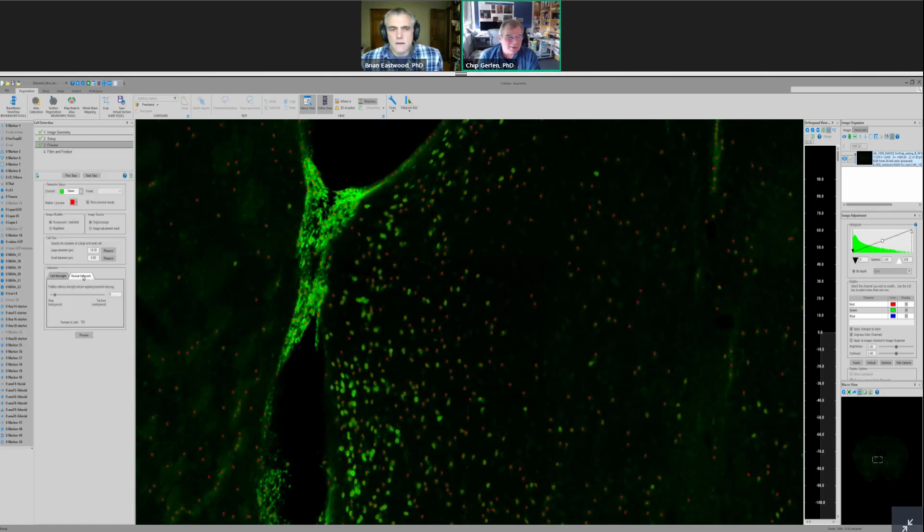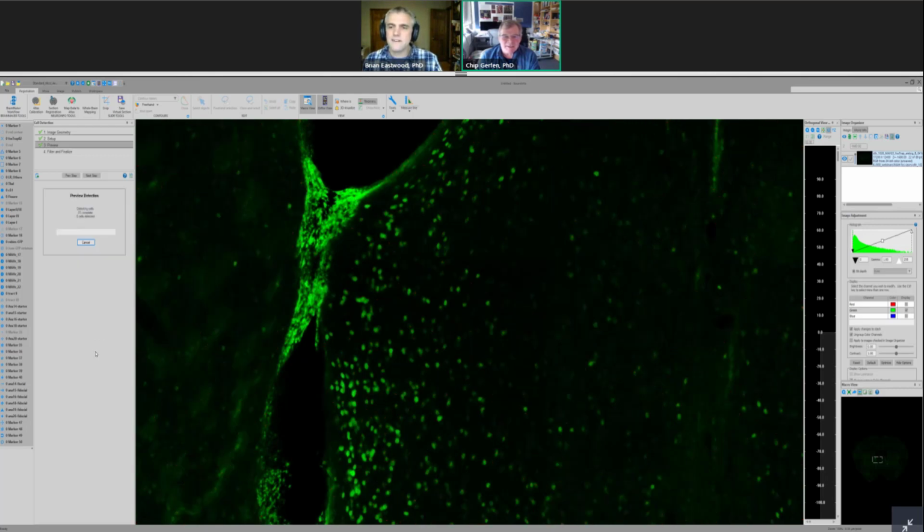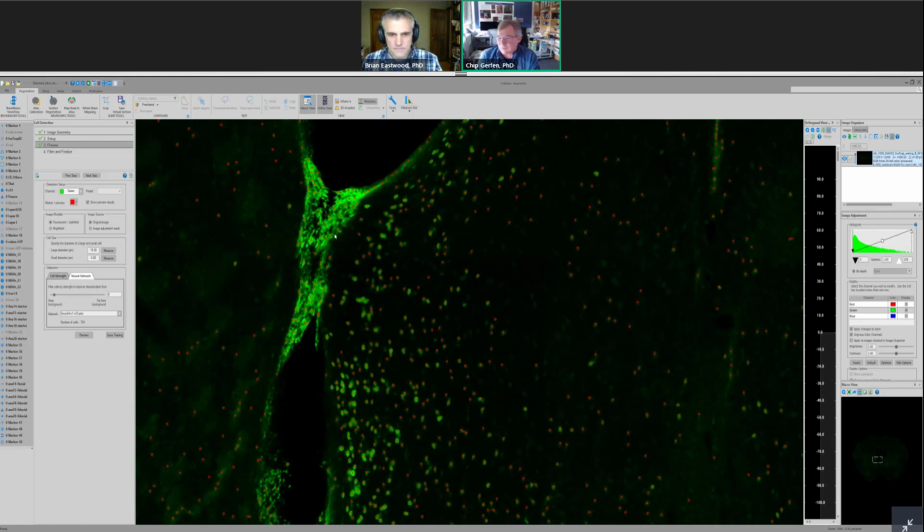And then we created a neural net. This is one of the first runs through that we did with the neural network for c-fos. We created a neural network and thought, did it do a good job? And the answer was, yeah, it did a pretty good job on the neurons, but it also ended up detecting a lot of things that were clearly artifactual in terms of the type of labeling we were looking at. And so what you're illustrating here is that designing and building these neural networks is an iterative process, and we're going through the process of improving these neural networks over time.